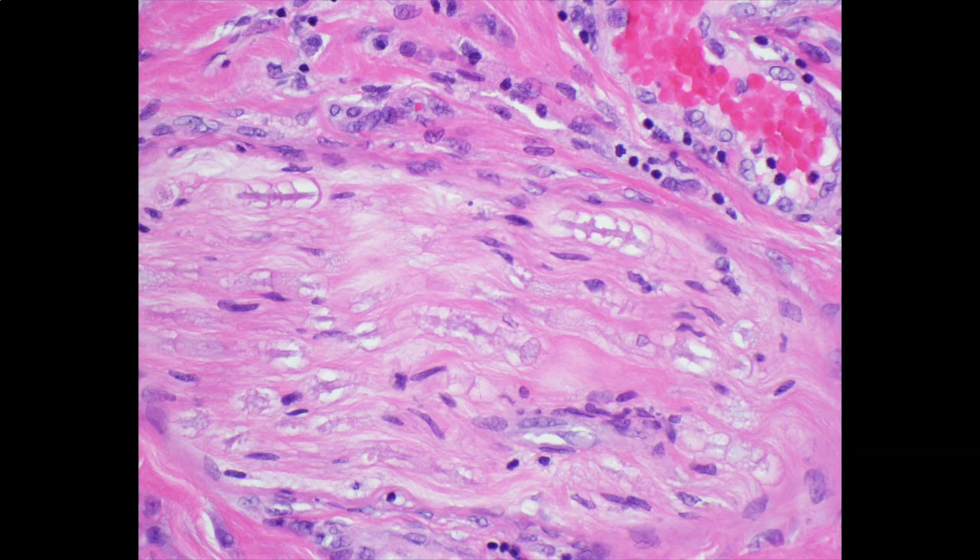Here is another example of a larger nerve from probably the subcutis — a deeper nerve — shown in close-up view. You can see the axon as a pink line running longitudinally rather than in cross-section. Here's one axon, another one down here, and another one here. The axon is pink and has white areas around it — that's myelin. Those white areas are where myelin surrounded the nerve. Myelin is made of lipid, so it washes out and dissolves during tissue processing, leaving a clear space, just like fat cells, vacuoles, and sebocytes.